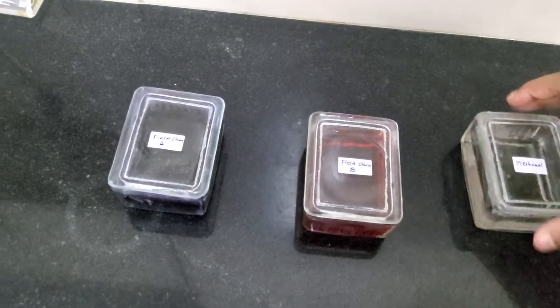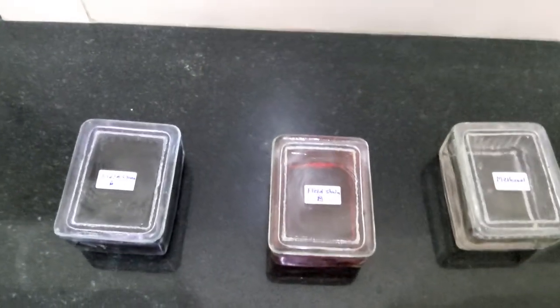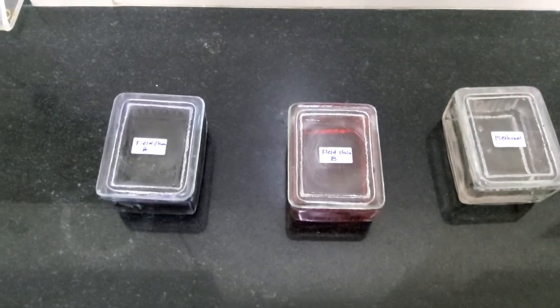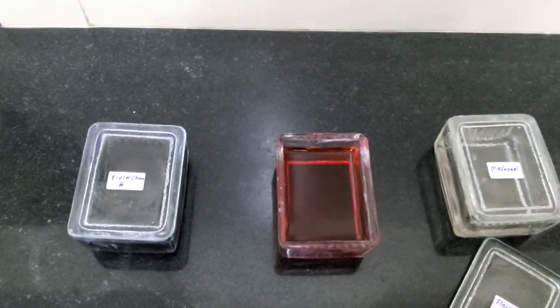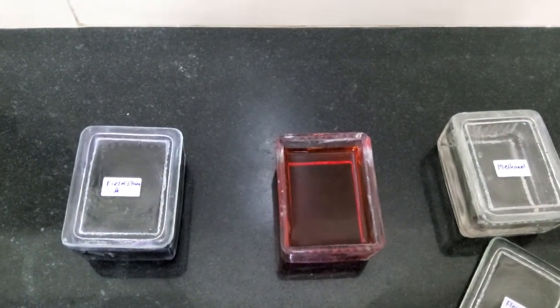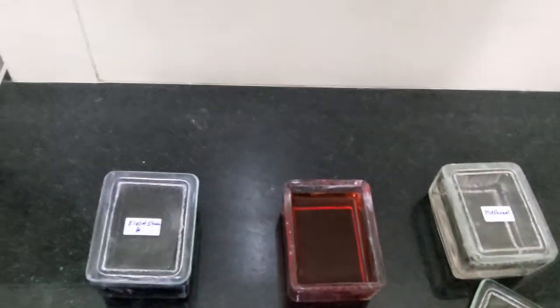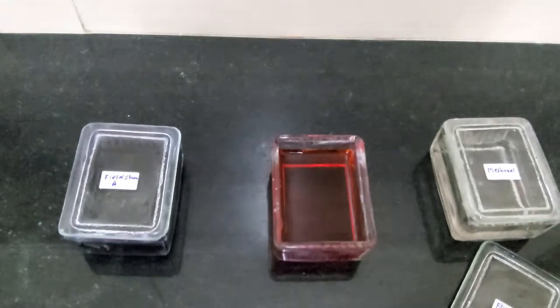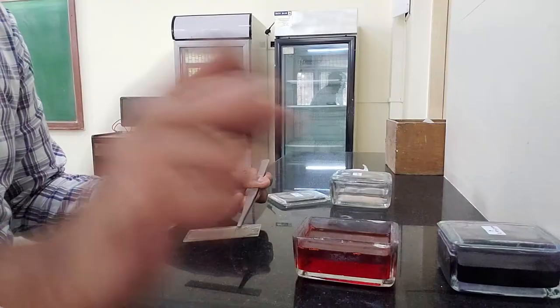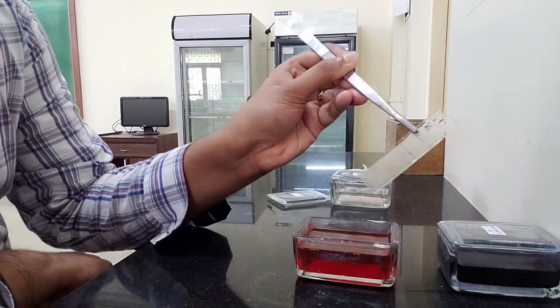The very next step after the slide dries out completely is going to be dipping it in the Field stain B for five seconds. I'm going to open and keep the Field stain B jar ready over here. Once my slide is completely dry, I will very gently using a forcep dip it into the Field stain B.